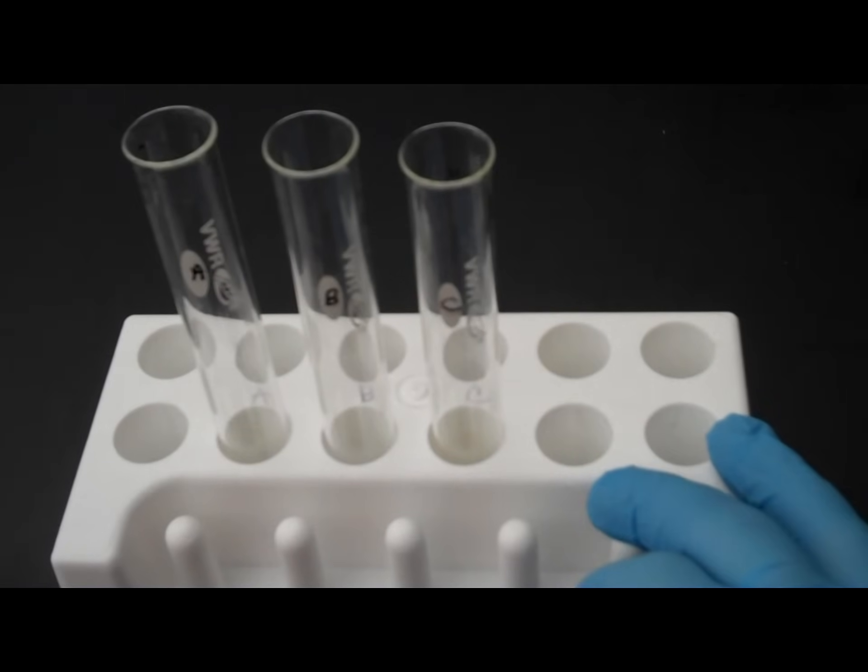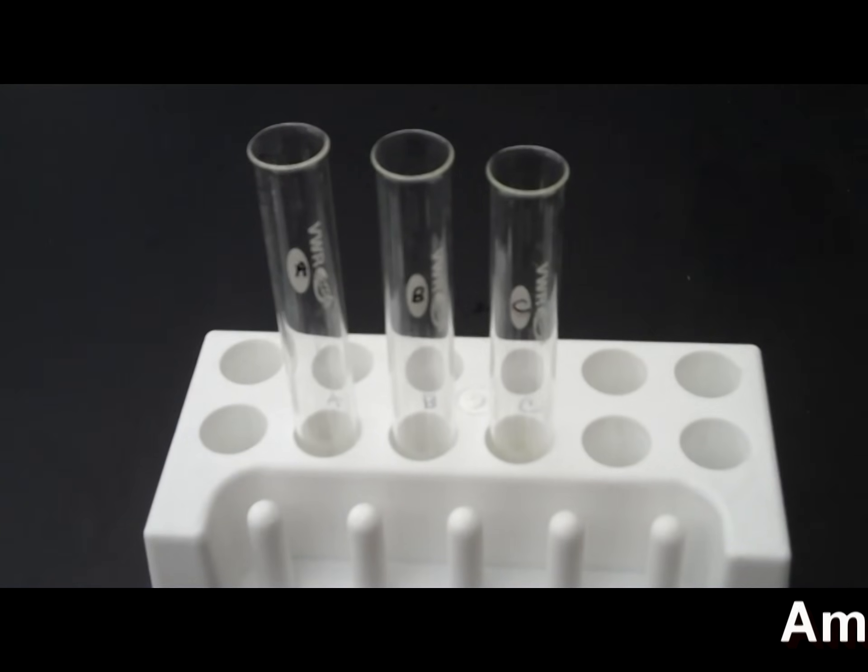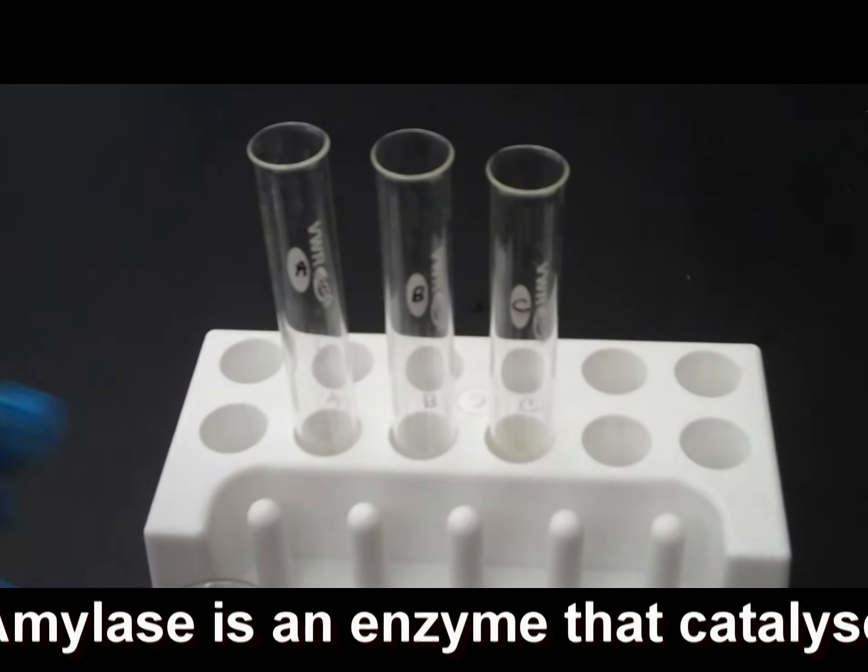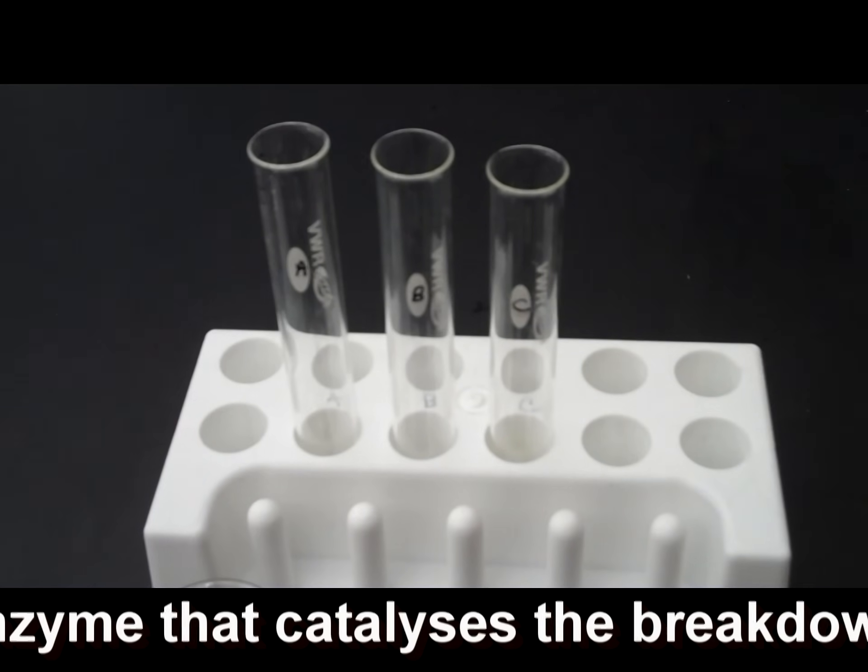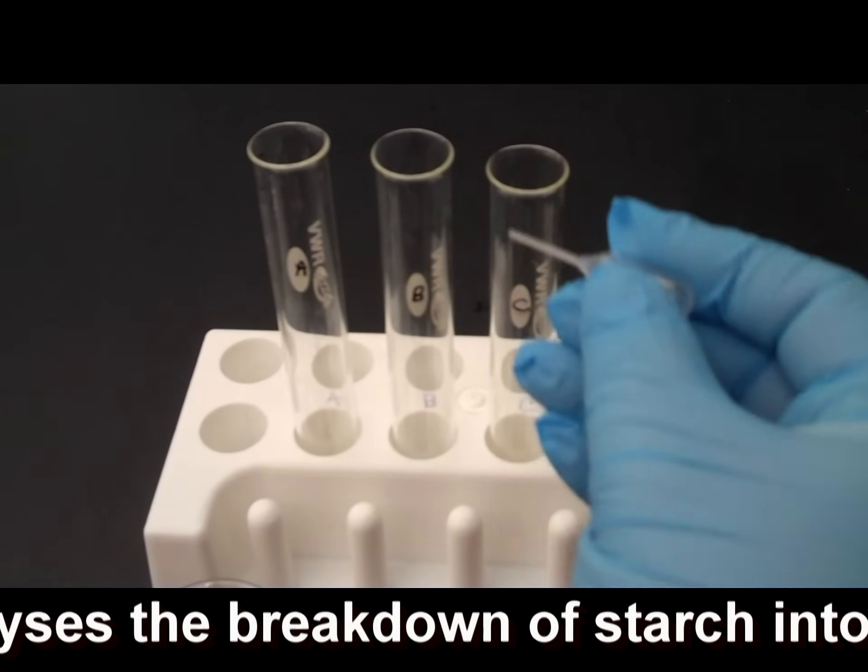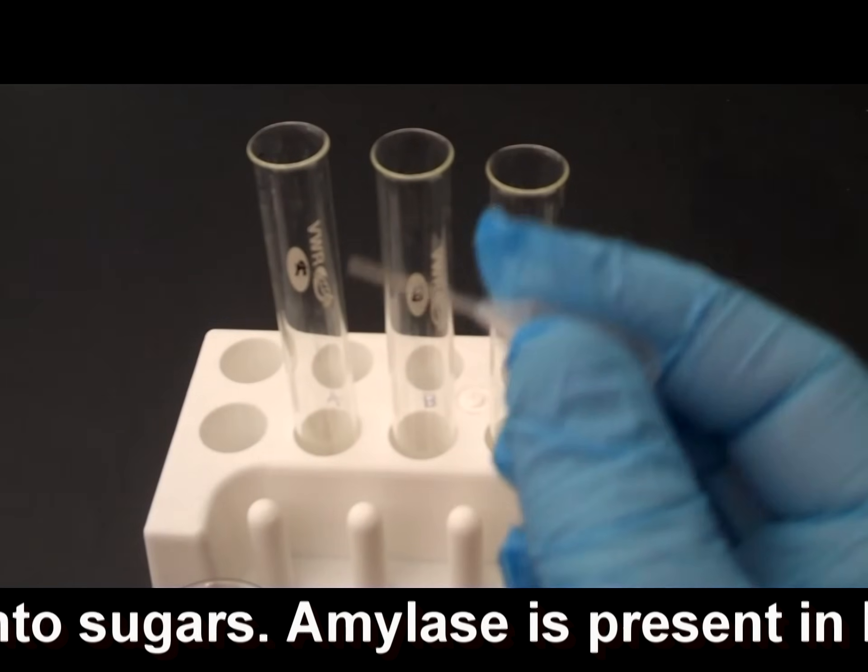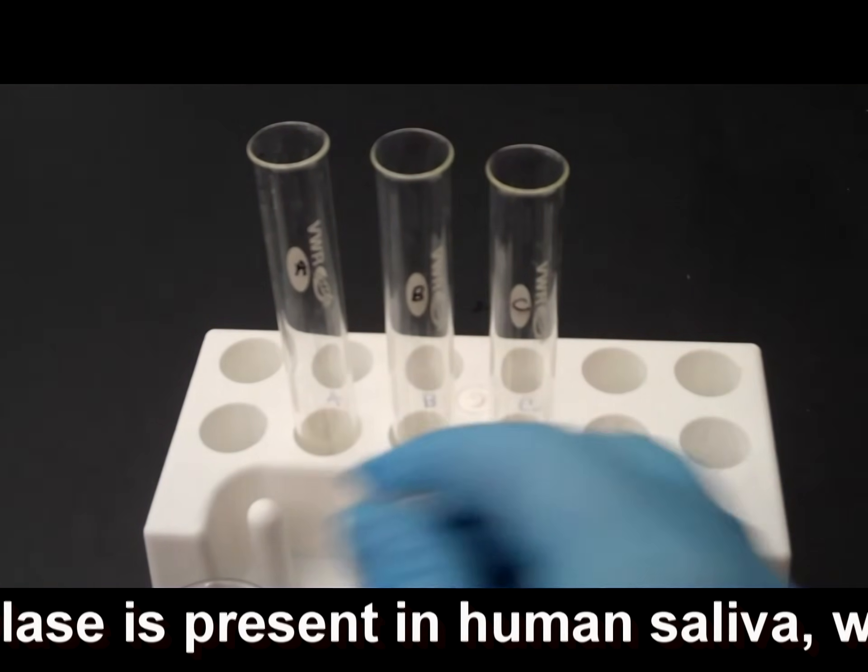So, I've got test tubes A, B, and C. And what I'm going to be testing today is what environmental factors affect enzyme activity. I'm going to start with my enzyme amylase, and I'm going to put two milliliters in each test tube. Since this is half a mil, I'm going to need four squirts in each test tube.